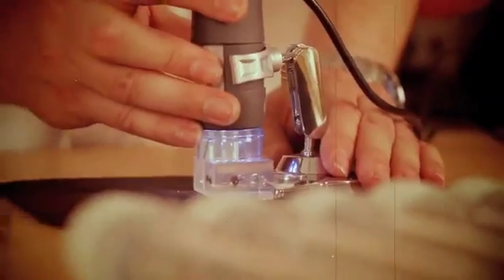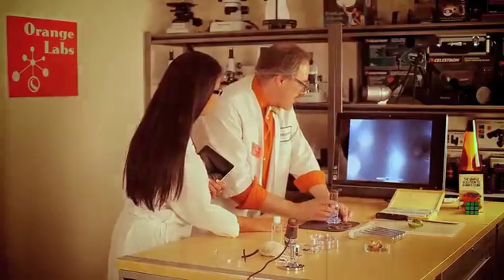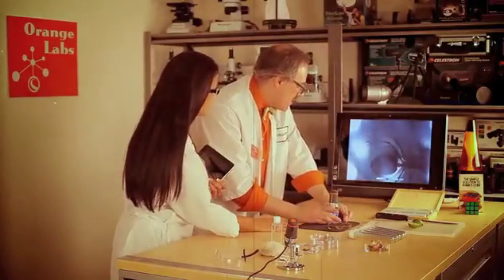Can you imagine all the things we could take pictures of with this? Why, we could take pictures of bacteria, microorganisms and spiders and ants and tomatoes. It has a 1.3 megapixel camera. I would be the envy of the entire science community with this. And it has three different magnifications: 10, 40, and 150 powers.